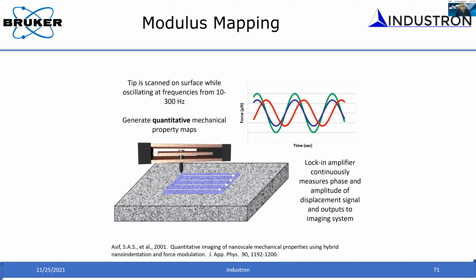For example, in the old days, we used cones with different cone angles. And this is not the same stress-strain relationship we talk about in uniaxial stress. This is an equivalent strain, because under the indenter, the stress state is very complex. It's not uniaxial. It's 2/3 hydrostatic, 1/3 shear. But we can define an equivalent strain.